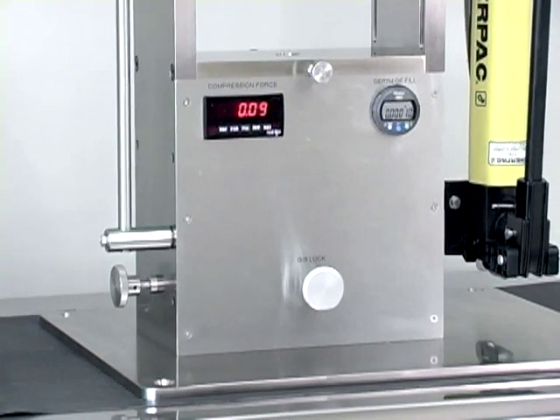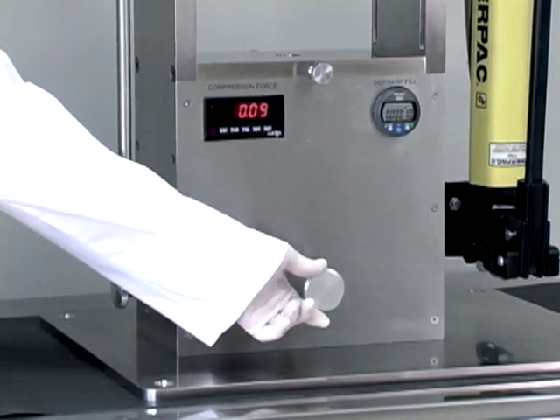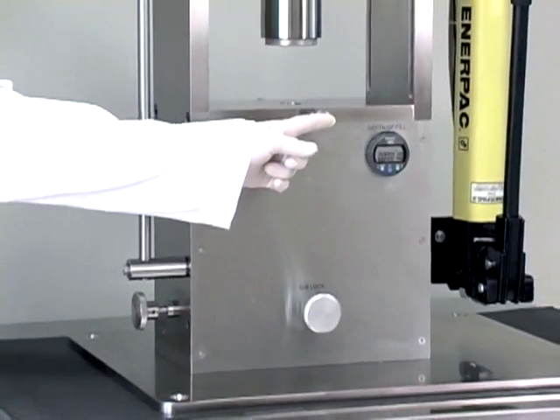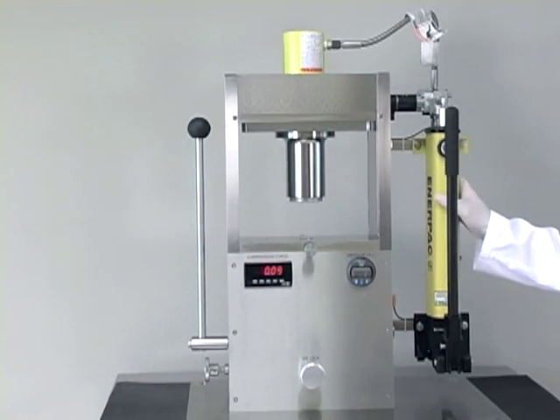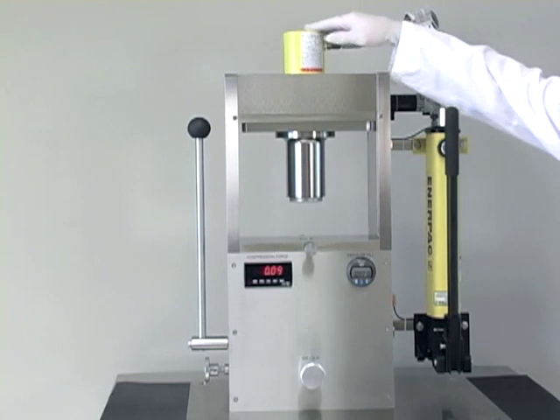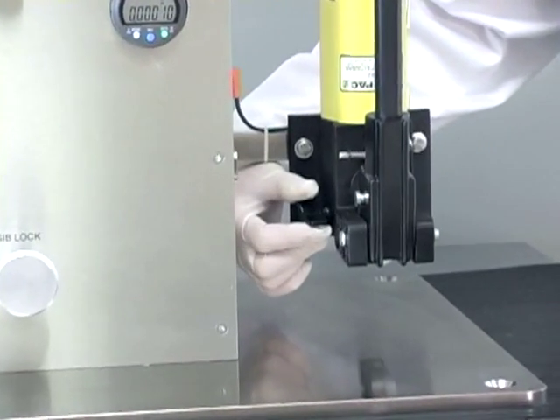There are several major components on the NPRD-10A: the micro adjustment knob, the gib lock, the depth of fill gauge, the die lock knob, the compression force meter, and the ejection lever. Next we have the hydraulic pump, the automatic relief valve, the hydraulic cylinder, and the manual relief valve.